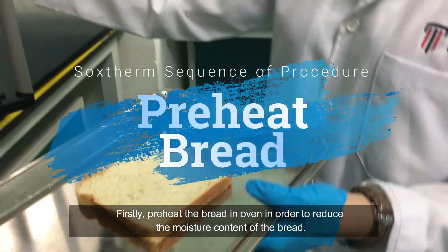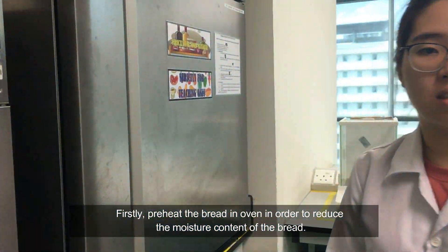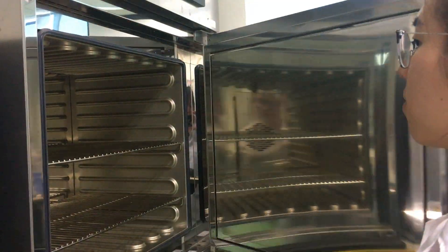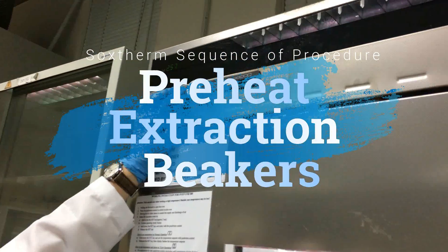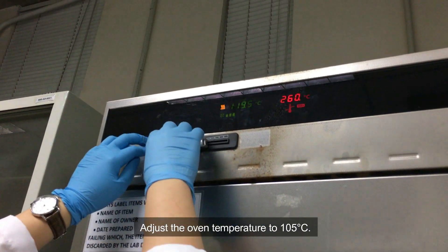Firstly, preheat the bread in the oven in order to reduce the moisture content of the bread. After that, take out the bread from the oven and cool it down. Adjust the oven temperature to 105 degrees Celsius.